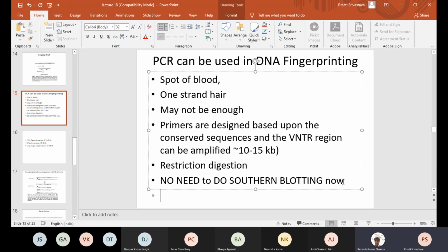No, simply agarose gel. Why would you do PFGE? PFGE is for larger fragments. In this case, it's a PCR product. So is it confusing, why is everybody quiet? In yesterday's viva, some of the students told me that some of the electrophoresis techniques are confusing. Are they confusing, class? Please ask me if you have any doubts.